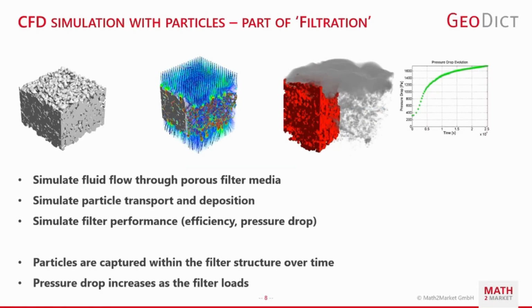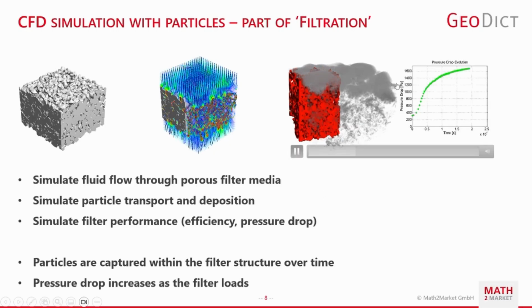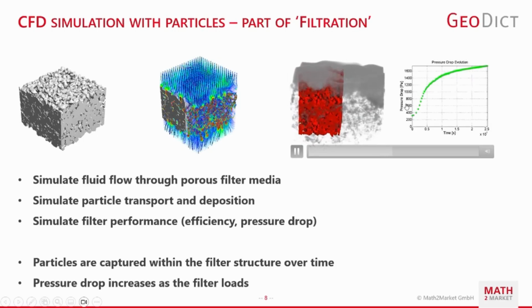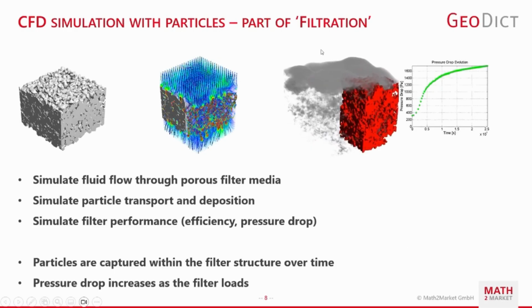We have also a business area called filtration, which makes use of CFD simulations with particle flow. So you simulate fluid flow through porous filter media, simulate how particles are transported through this filter and deposited or captured, and then you can simulate the filter performance based on that. There's a little animation showing particles flowing from top to bottom through this material being captured, and as they are captured, the flow becomes more and more difficult, and the pressure drop is changing over time, with a filter cake developing at the top.